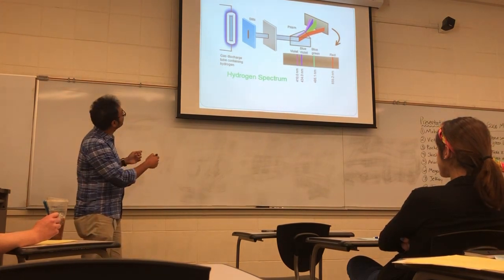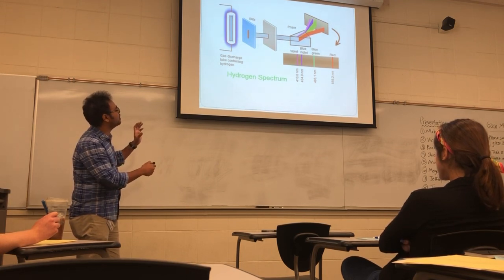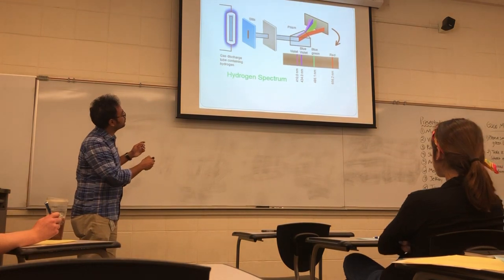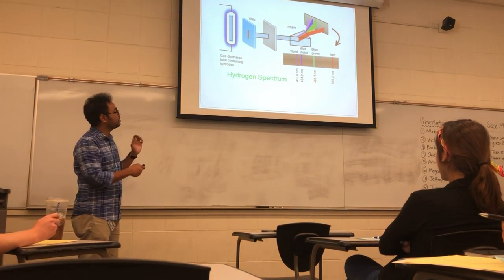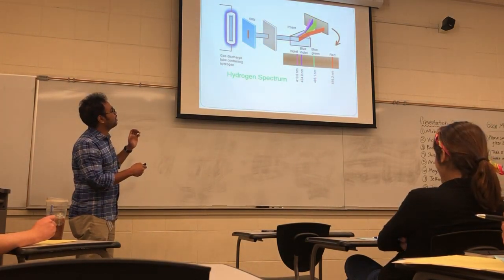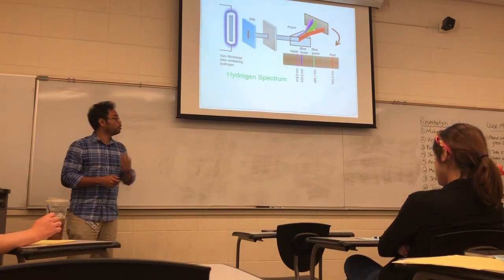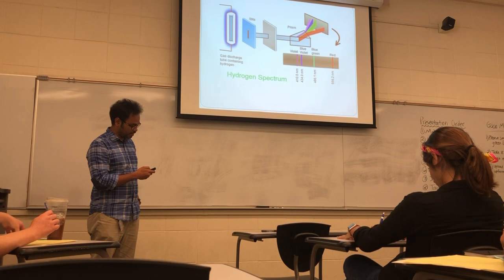So this is your hydrogen lamp, and the light goes through the spectroscope. These are the different parts. The prism is the most important part, which separates the light into its individual components. The hydrogen lamp has these 4 visible parts of light, which are violet, blue, green, and red. You will see them using the spectroscope, and since this is calibrated, you can measure their wavelength, okay? From that wavelength, you can calculate the energy and draw the energy level diagram.